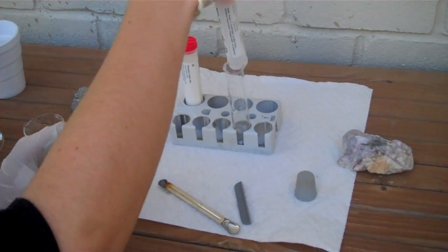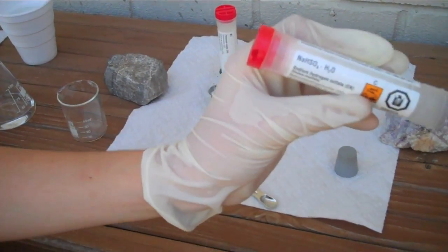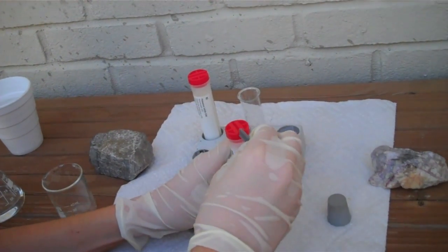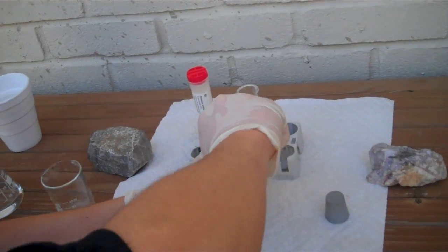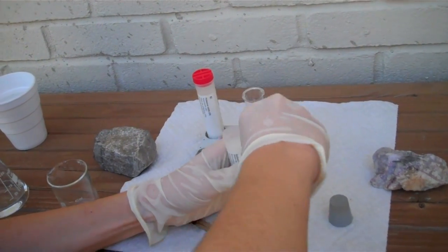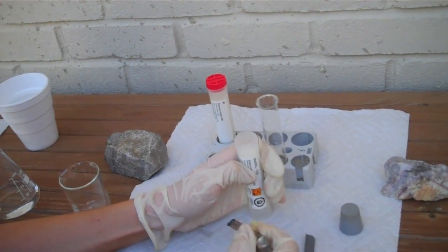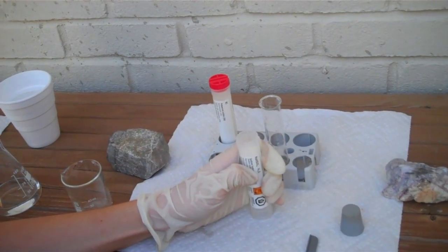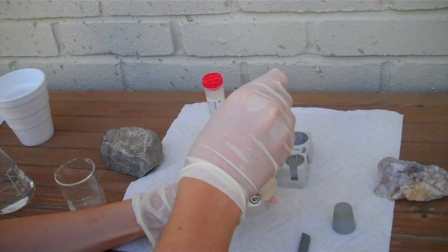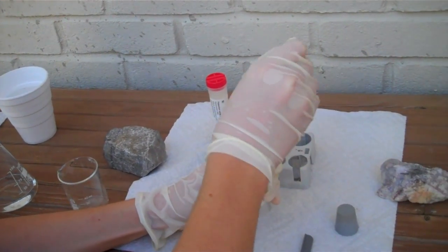So now it's dissolved. Now take some sodium hydrogen sulfate. Just a word of warning is that this is corrosive, so be very careful when handling it. Now take a small amount of the sodium hydrogen sulfate and add it to your potassium iodide solution.